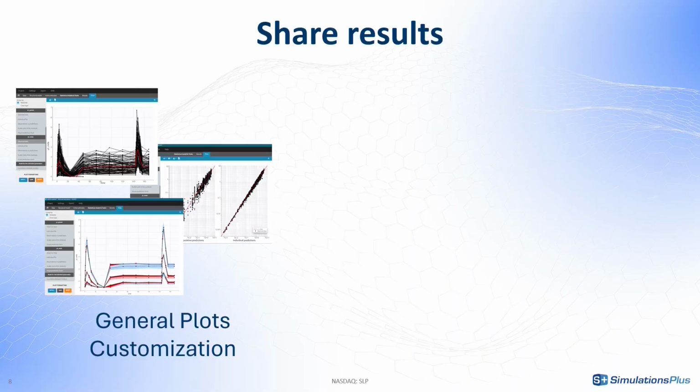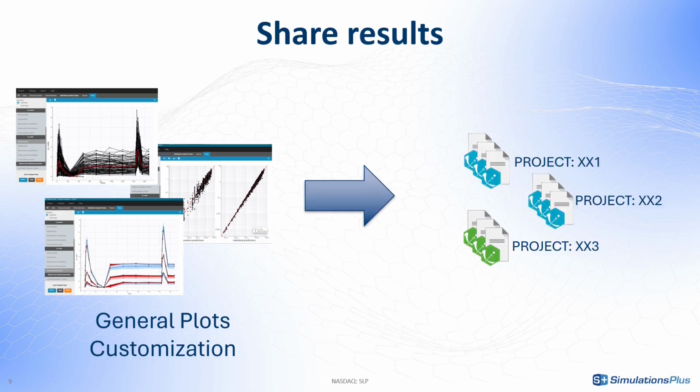In the first situation, I would like to share the results. I have customized my plots to a format I prefer to use consistently. This customization is not specific to any single project, making it suitable for different studies. It could serve as an in-house plot preset according to some company guidelines for presenting plots uniformly.